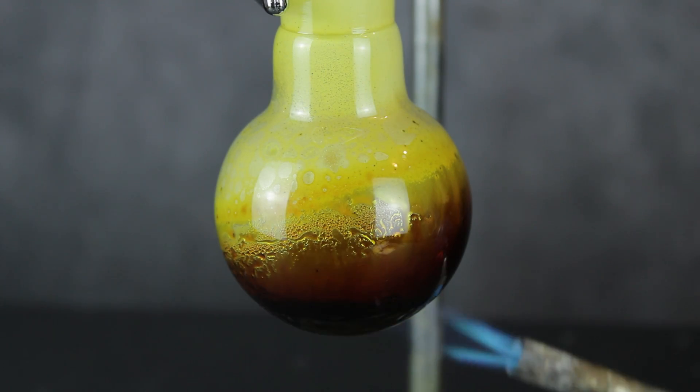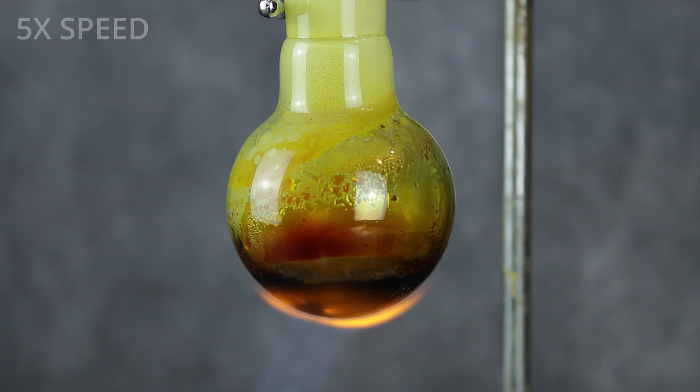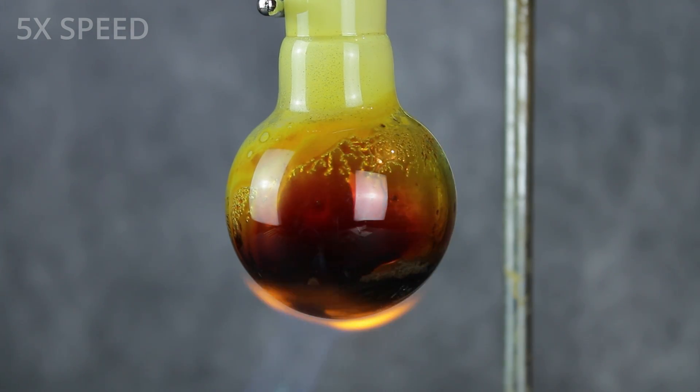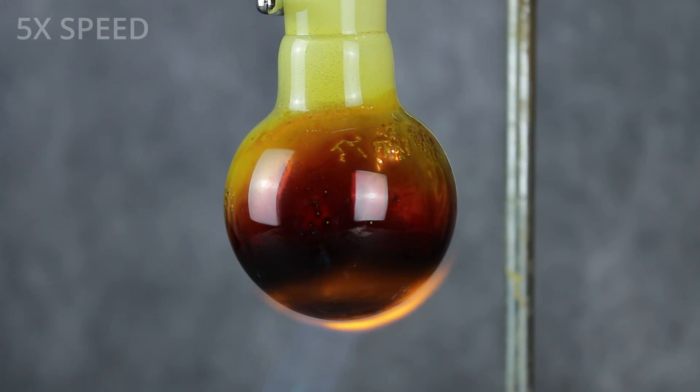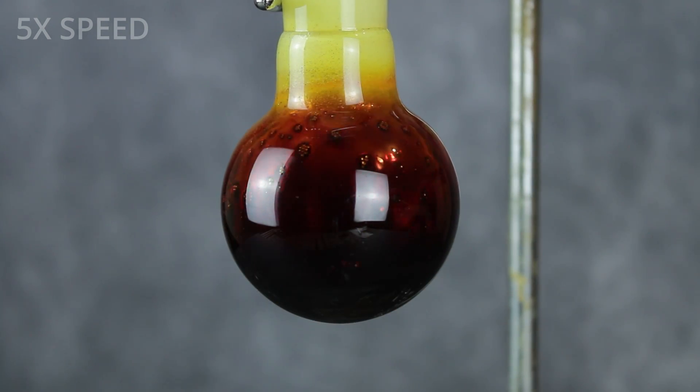As the reaction progressed, a red liquid could be seen refluxing in the flask. Given how strongly I was heating things, this was almost certainly a mixture of sulfur and phosphorus pentasulfide, probably heavier on the pentasulfide since most of the phosphorus seemed to have reacted. I kept refluxing the mixture for a few more minutes and then allowed everything to cool back to room temperature.